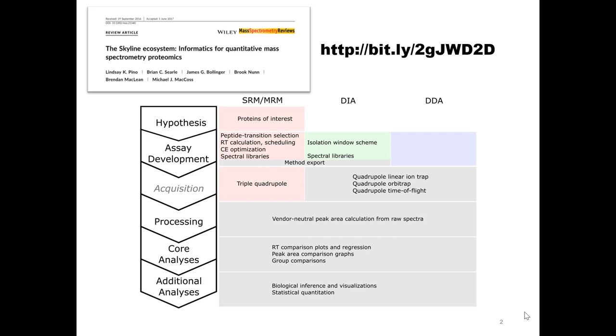So we went over a little bit yesterday how in Skyline, if you had some protein of interest, you could go, for example, to Uniprot and say, I'm interested in vitamin D binding protein, and download the FASTA. Then we talked about, oh, there's different isoforms, how's that going to mess up my experiment? We went into Skyline and we played around with our different settings, and we said, let's say 1 miscleavage or no miscleavage. Let's say I want amino acids from length 2 to length 100 versus a length of 6 to a length of 25, and how that was affecting some of the different peptides that we might be able to target. Yesterday, Sue went over all the different peptide transition selection parameters that you'd have to think about if you were making one of these assays.